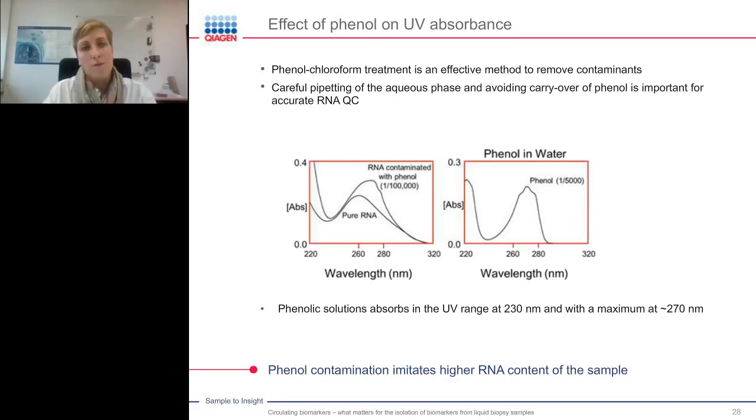So if you are using phenol in your workflow, it's very important to do careful pipetting of the aqueous phase and avoid carryover of phenol, because this can falsify the RNA content and make you think that you have a higher RNA content in your sample than what's actually present.